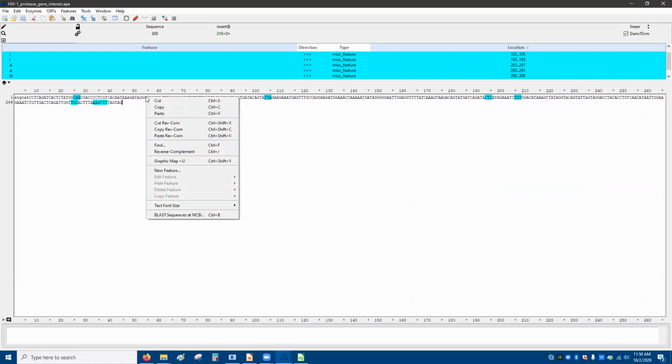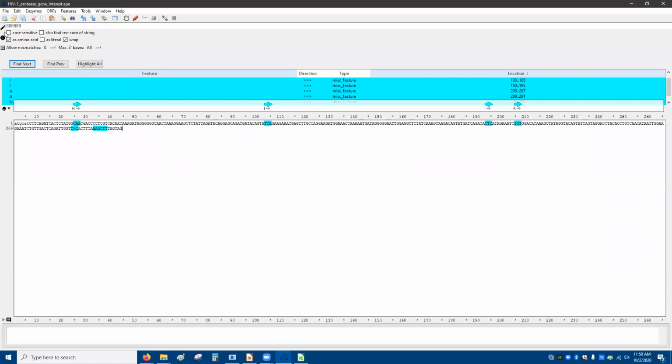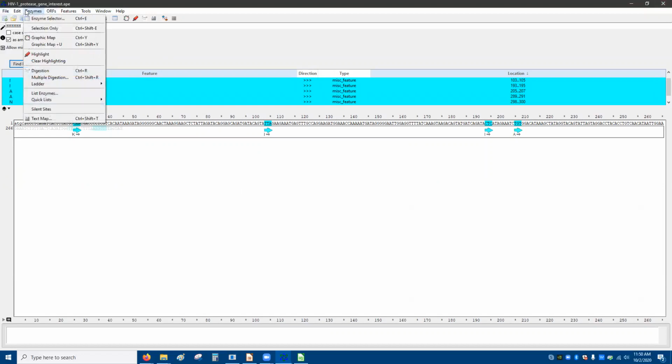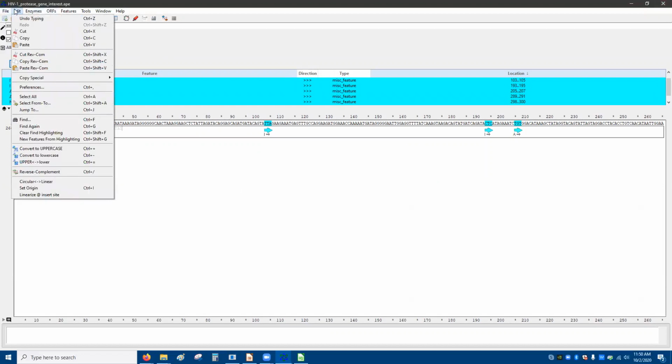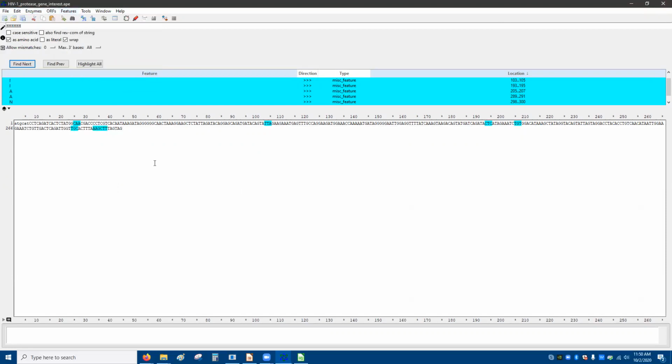So annoying. I feel like it's some kind of inspection tool. No, I don't want that. That's one thing about this program. There are a lot of hotkeys, and I don't necessarily know what all of them are. That's what it was. I hit space. So there we go. Seems like an odd place to put a hotkey.